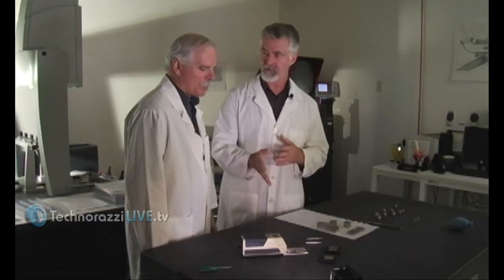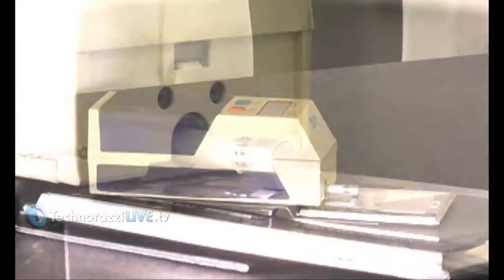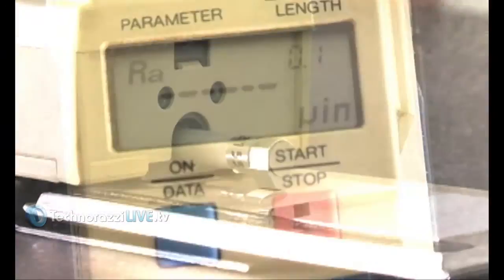Now we're in the lab with Craig Howell of CPM Labs and today we're going to look at what you call a profilometer — some call it a surface roughness gauge. It measures the roughness of different metals depending on how they're machined or ground.